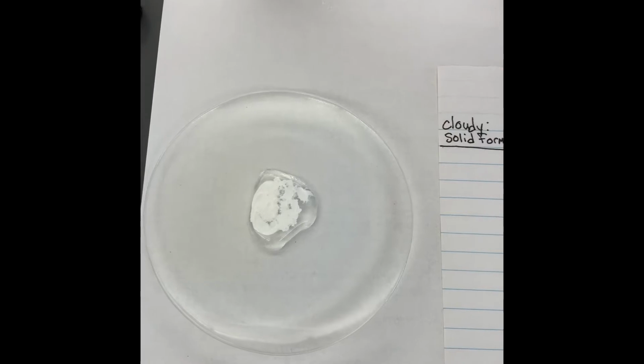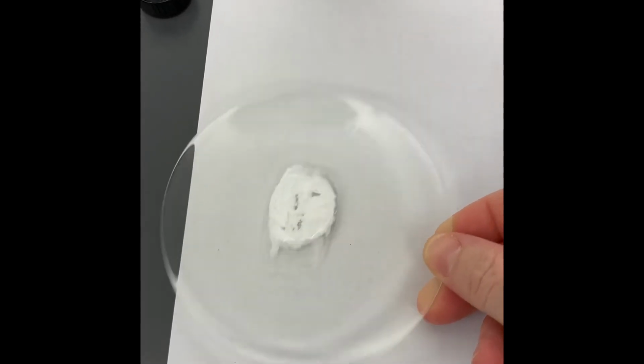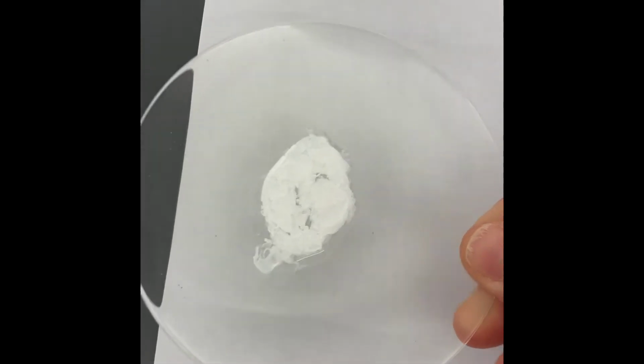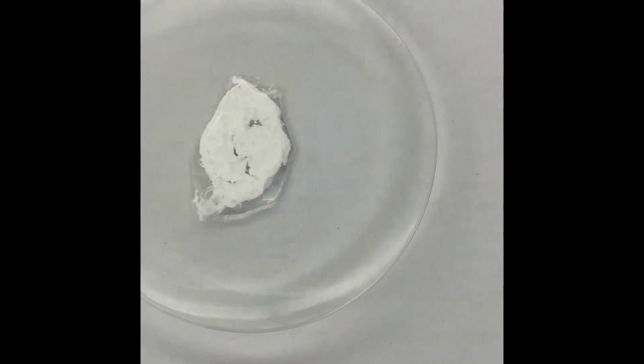All right, something happened there. We had a color change and it got cloudy. So let's record that.